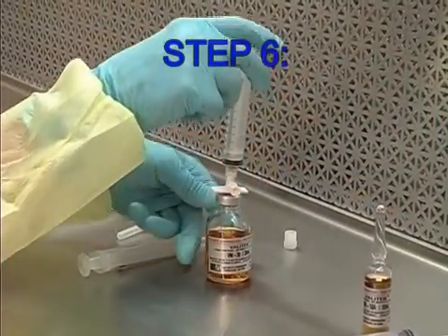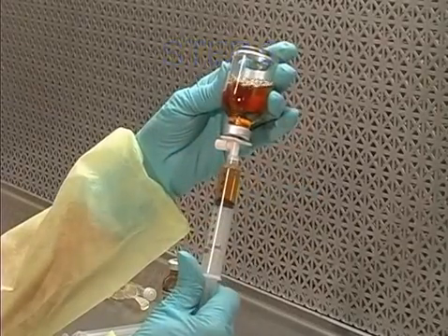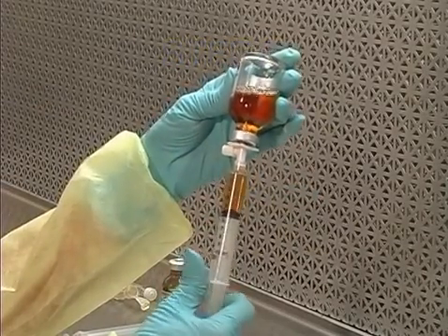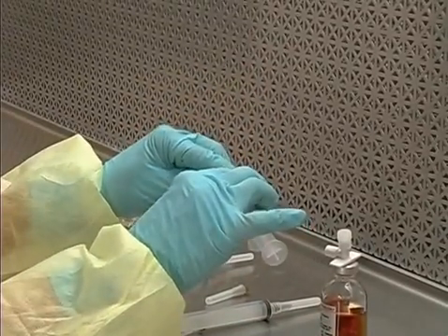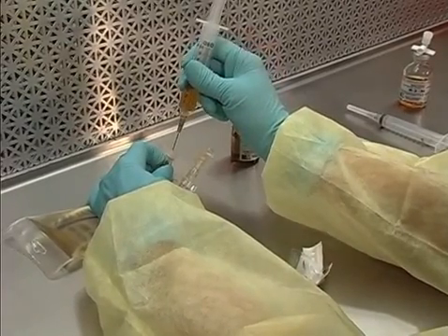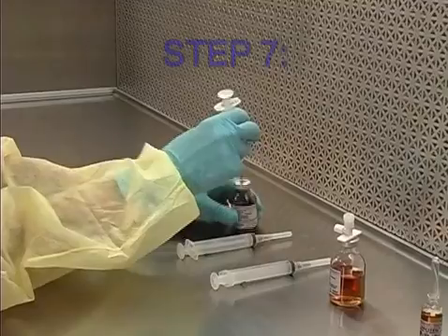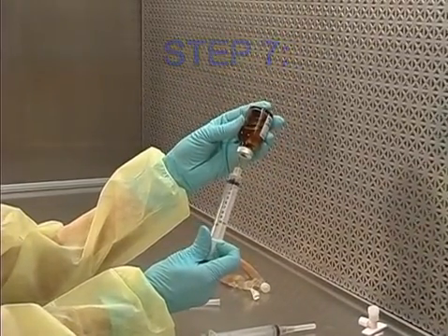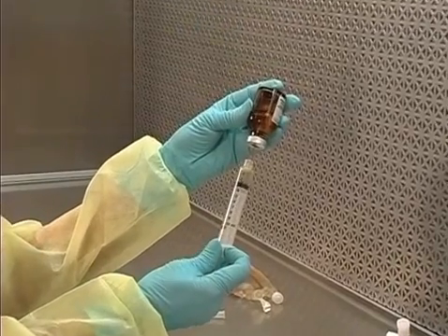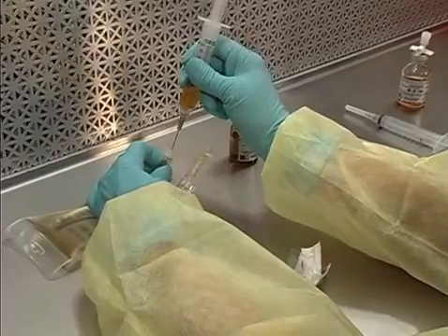Step 6: Using a 10-ml syringe, make a second withdrawal of 5 ml of VM-30 through the dispensing pen. Attach a needle to the syringe and transfer into the final container. Step 7: Using a 10-ml syringe, make a second withdrawal of 5 ml of VM-20R and transfer it into the final container.